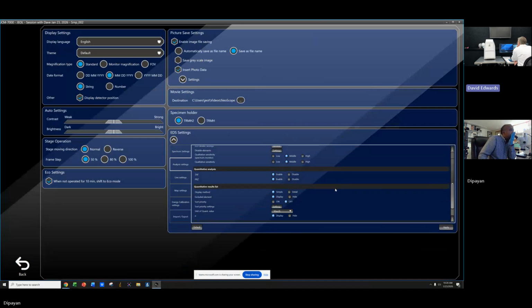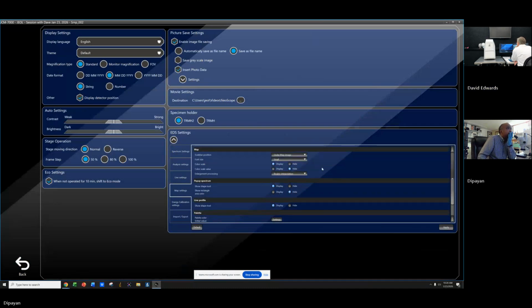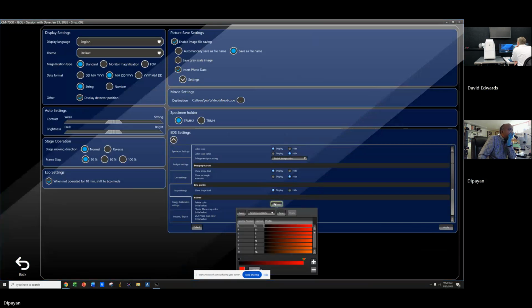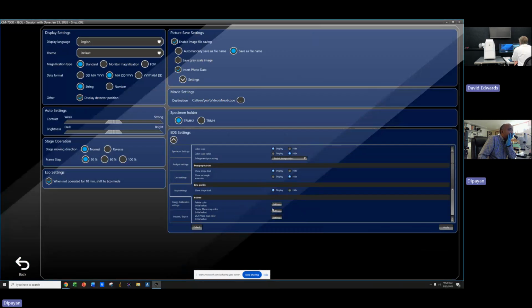Map settings. Scroll all the way down to palette. So palette color settings. And then auto. Auto, okay. So it's going to cycle through about 5 colors, and it'll just keep reusing the same 5 colors. And same thing for the cluster map. Nope, don't worry about those.